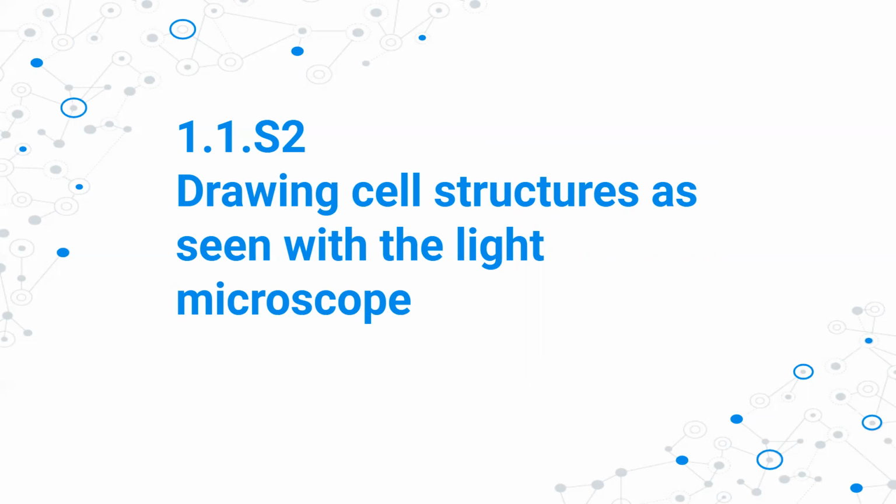Then show your work: give me the field of view at low power, field of view at high power, your mags, and the diameter of your cell or whatever you're measuring in millimeters and in micrometers. Then show your work so I can see what you're doing. It doesn't matter what format you use, but that's the basic info I'd like to see. Does that make sense? Okay.